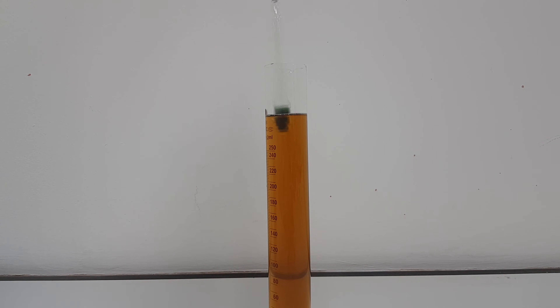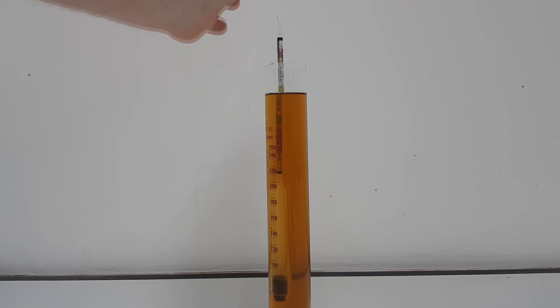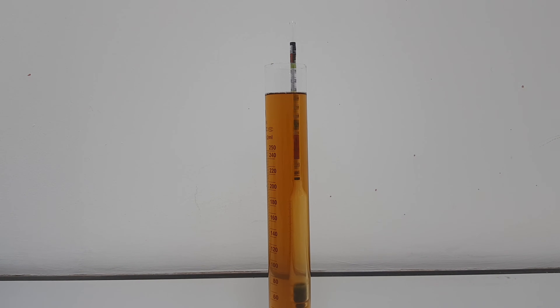Lower the hydrometer carefully into your sample, and as you feel it start to float, give it a little spin. This is to help prevent the hydrometer from sticking to the side of the measuring cylinder, which could interfere with the result. Also check to make sure that the hydrometer isn't resting on the bottom of the measuring cylinder, as this is also likely to interfere with the result.